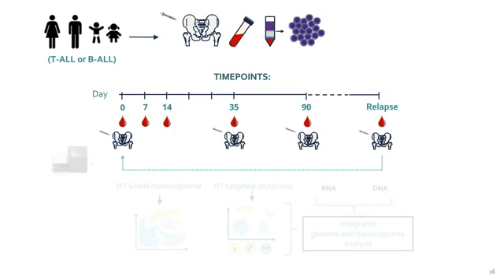These include 2 blood samples during early treatment, but also a blood and bone marrow sample at day 35, which coincides with the clinical assessment of minimal residual disease. And then, in case there is a relapse, we reactivate the collection of samples. All the samples are very fresh. Within an hour, we have them in the lab and start the processing. For that, we isolate the mononuclear cells by gradient centrifugation with Ficoll and cryopreserve the cells.